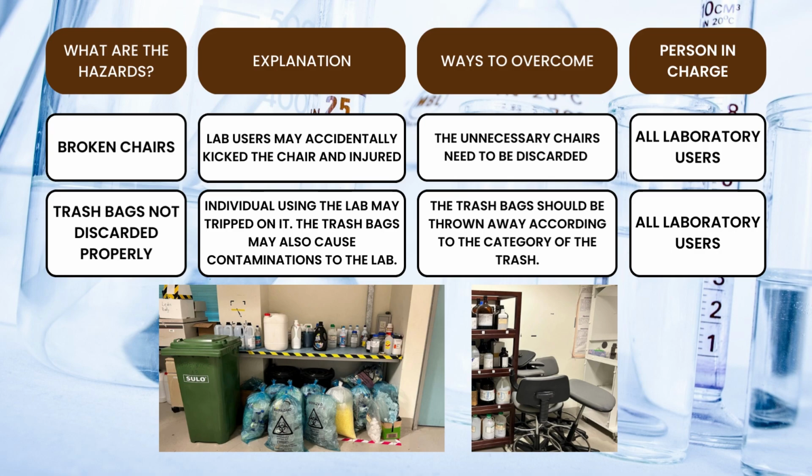And lastly, a pile of trash bags was found not being discarded properly. It is dangerous to the lab users as they may trip on the bags, and contamination from the lab waste may cause serious health problems to them. All laboratory users should throw these bags based on the trash category.